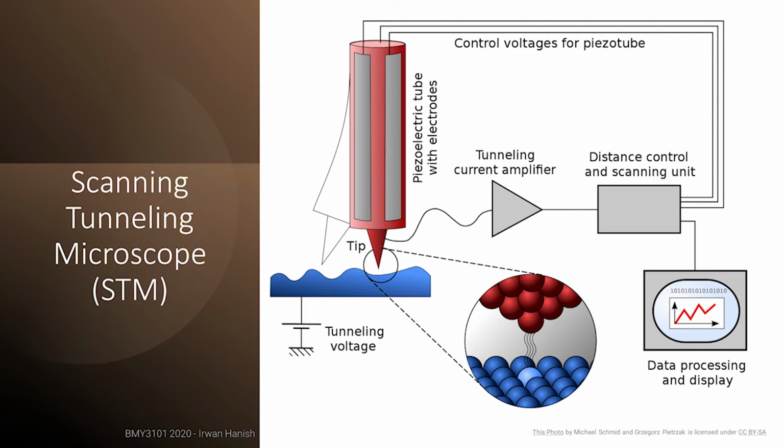They can be on top of each other. And when this happens, their electrons can probabilistically be found in each other's atom. So you can find the probe's electrons in the specimen, and you can find the specimen's electrons in the probe. So that's roughly what tunneling means here in our context.